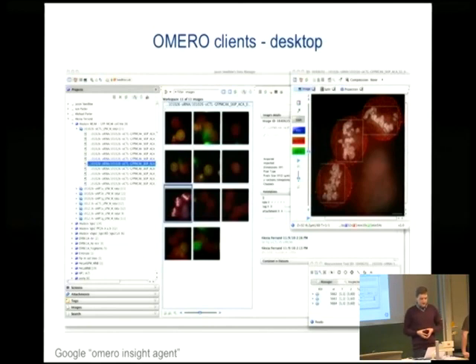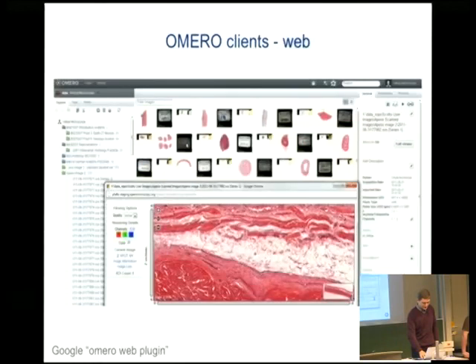It also, as I mentioned, shows metadata on the right. There is a full image viewer with regions of interest, rendering of multiple Z slices through a biological sample, handling of big images. So the zebrafish was an extreme example, but usually images in life sciences can go up to very, very big resolutions.